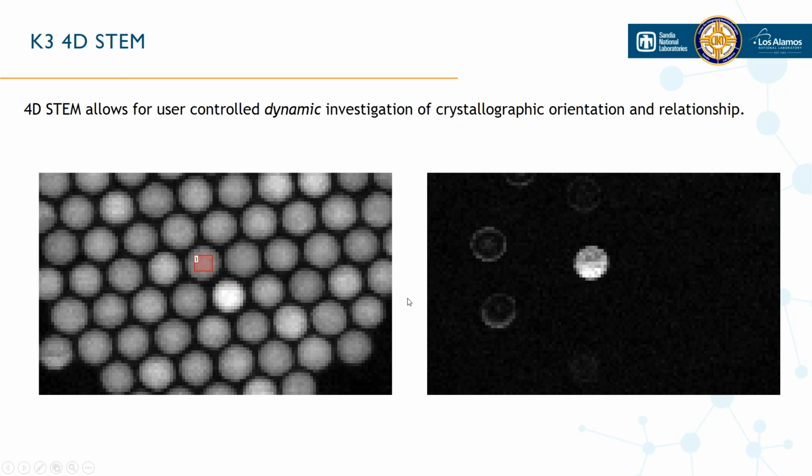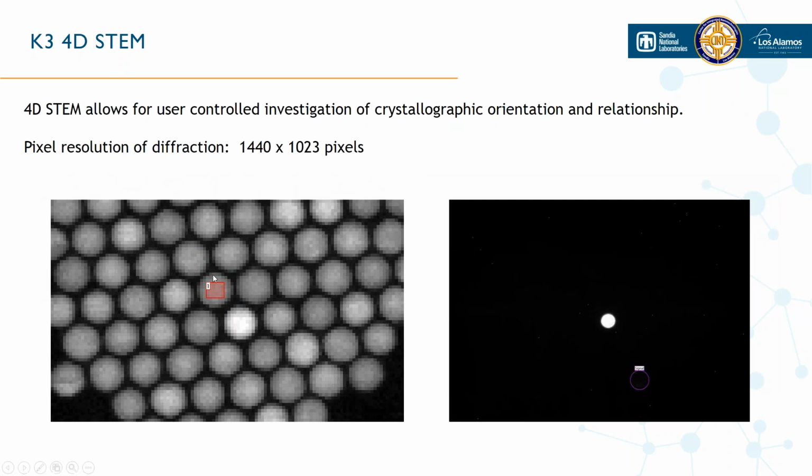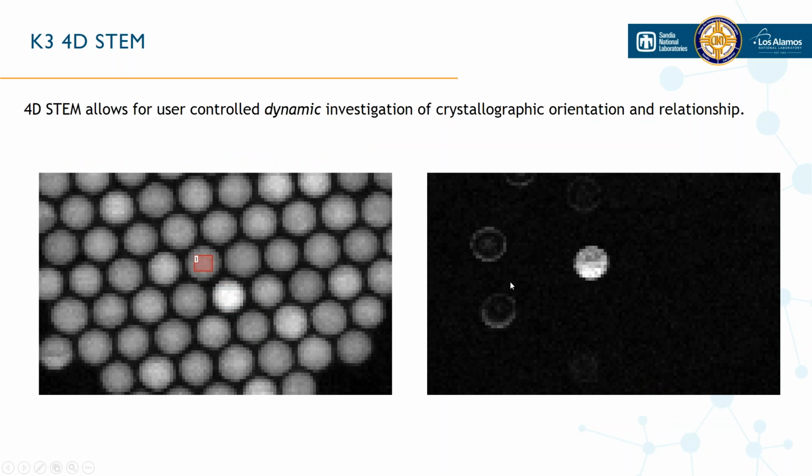So you can see here that in terms of this crystallographic orientation of the core of this particle, we're seeing some out here on the shell. Again, we still need to understand what's going on here, but it's quite powerful being able to switch between these two modes on the same camera and get complementary information that we can then use to build the story.